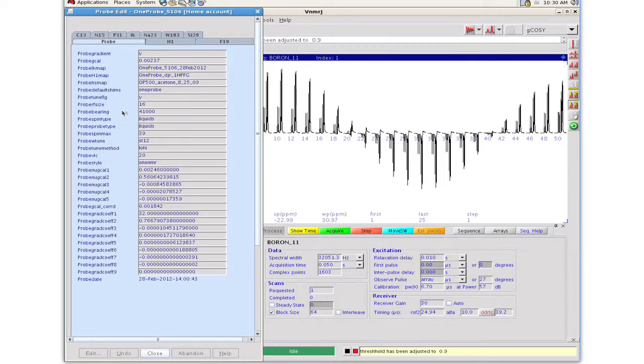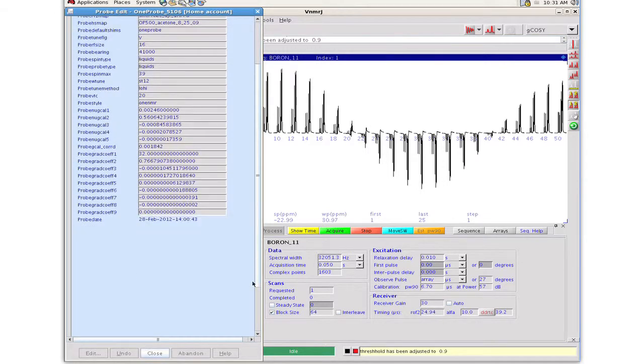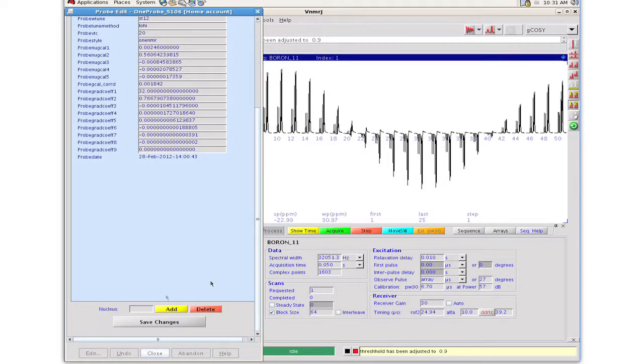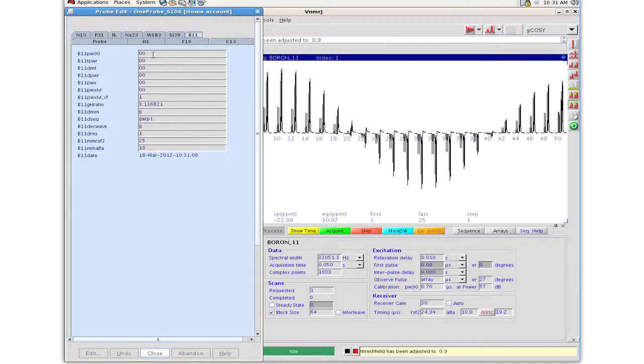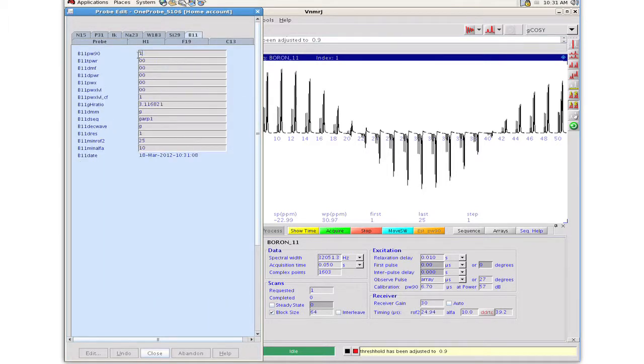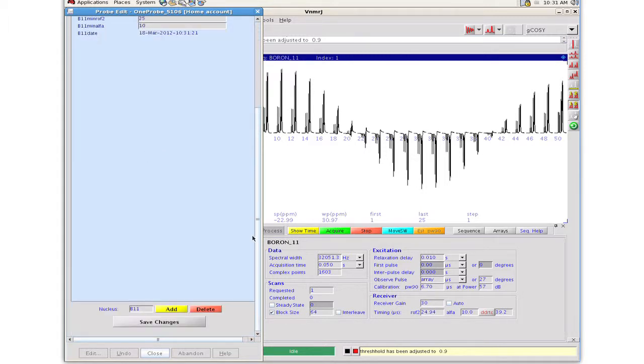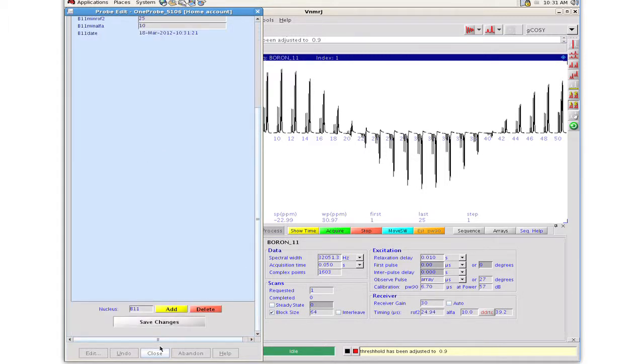There are tabs for several nuclei in the probe file, but B11 is obviously missing. We add a new B11 tab to the file using the Add Nucleus button. We enter the 90 degree pulse width and the power level, save the changes, and close the probe panel.